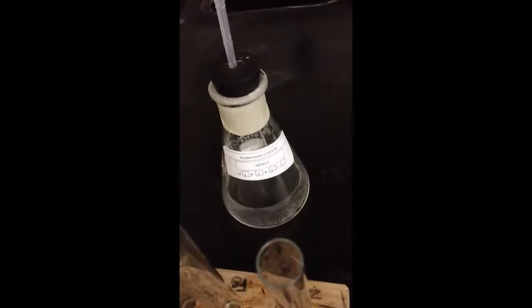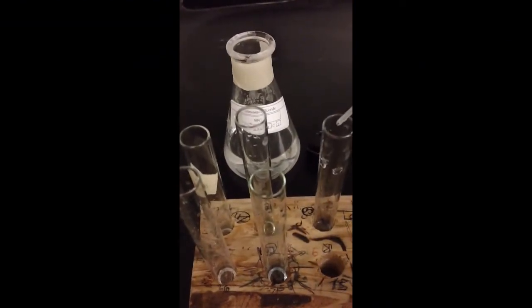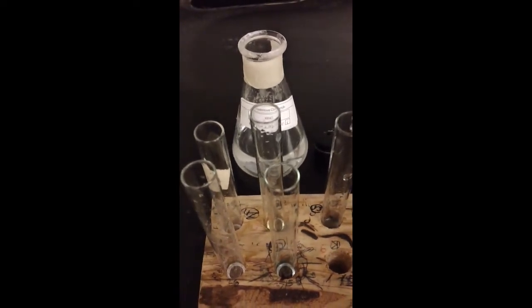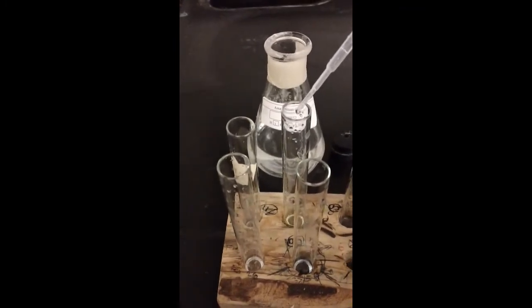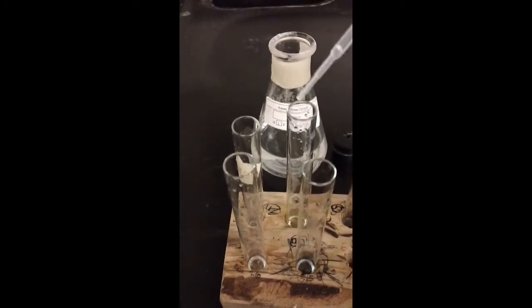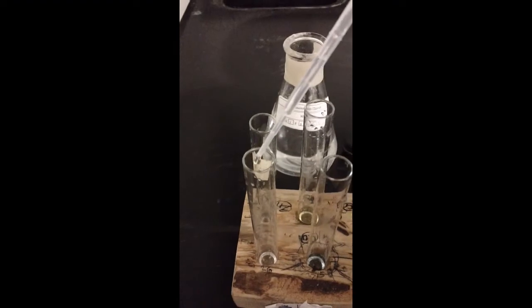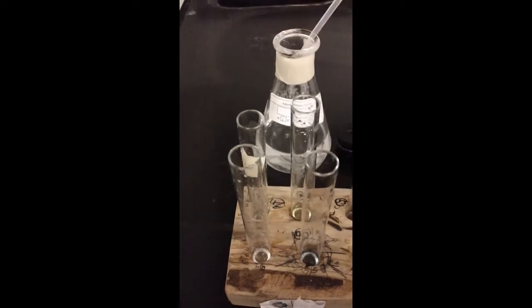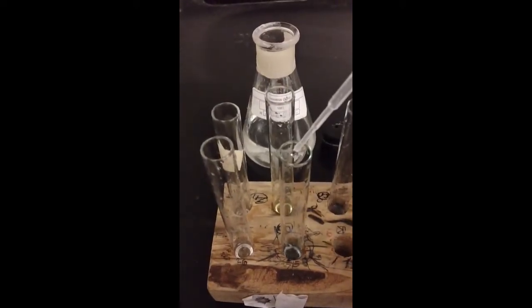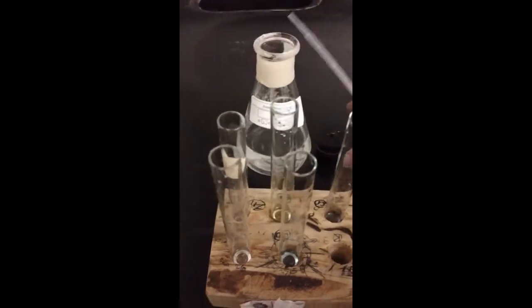I double check the bottle, make sure it's NH4Cl, and then I add my 10 drops. So I've added about 10 drops to each one.